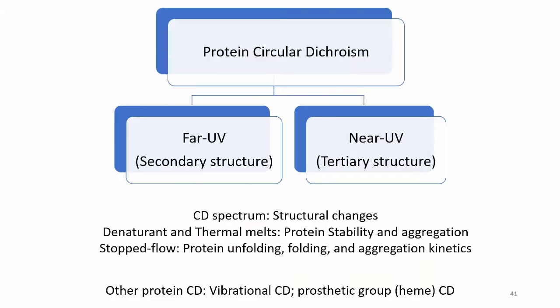In the case studies we have seen, we have been using protein circular dichroism, and most of our papers have circular dichroism spectra. As we have seen, we have to use two probes: far UV-CD to monitor changes in the protein secondary structure, and near UV-CD to monitor the tertiary structure. By simple comparison of the CD spectrum, we can see whether a protein is alpha helical or beta sheet, particularly in far UV.